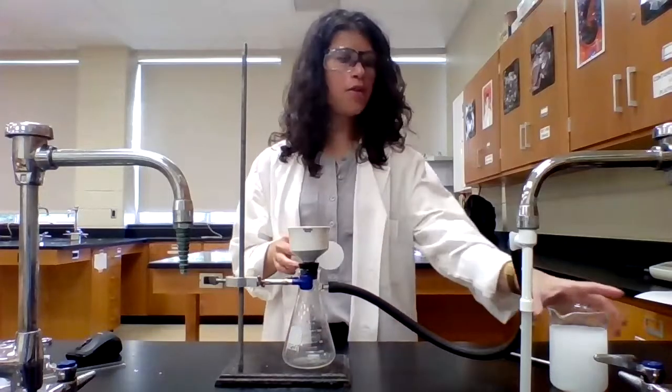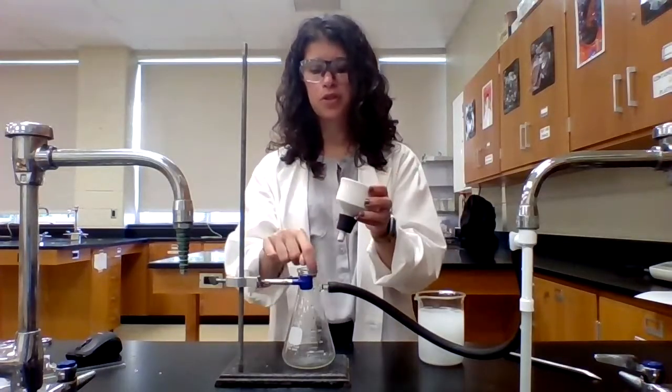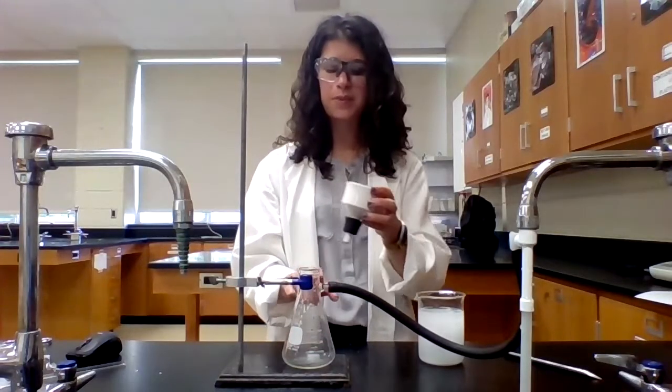Okay, so now that my reaction is complete, I need to collect my precipitate. I'm going to collect it on this piece of filter paper here. And what I'm going to do to collect my precipitate is what's called a vacuum filtration. So in a vacuum filtration, what we use is a Buchner funnel, which is this here, has a rubber stopper, which creates a nice seal. And then this piece of glassware is what we call a filter flask. It's also sometimes called a sidearm flask because of this piece right there.